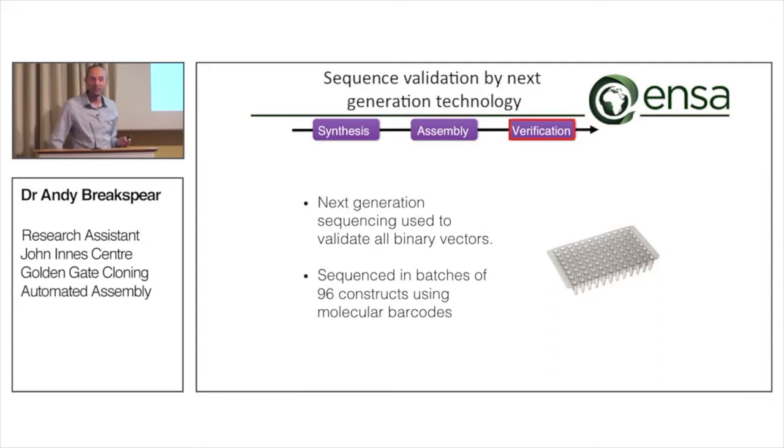I'll tell you where they come from, and it's all from one particular reason: if you use multiple copies of the same DNA part, then you're inviting recombination in bacteria. That's what we found, that we were getting looping out of large parts of the construct. So I'd thoroughly recommend not repeating parts if you're using the Golden Gate system. I was worried about it because I thought you might get silencing in the plant, but actually the problem comes earlier than that, in recombination in the bacteria. So we needed a bit more of a traditional screening of the white colonies for those, but we got through it very quickly.